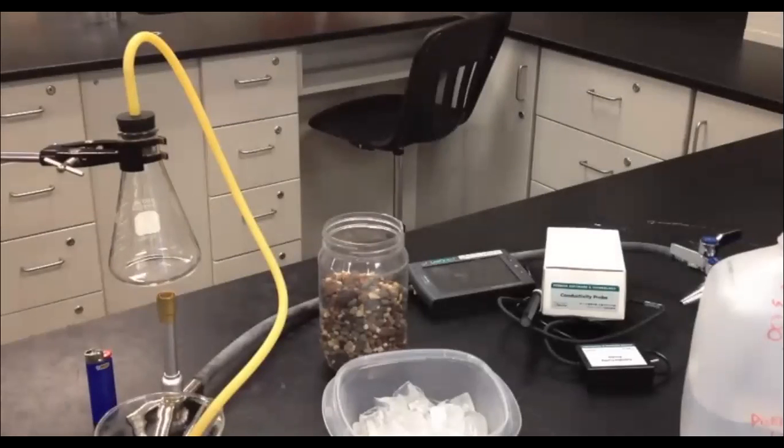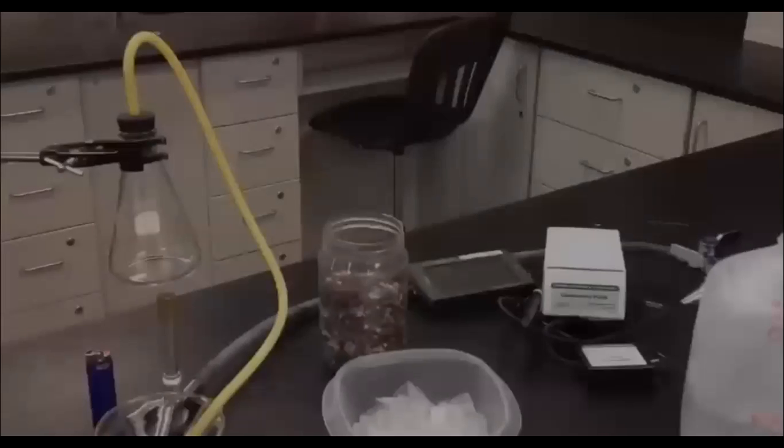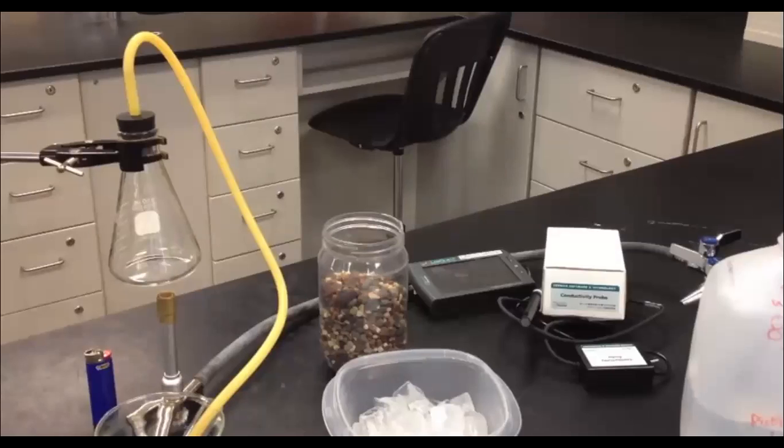So can we take salt water and turn it into fresh water? That's the purpose or objective of this lab, to take salt water and run it through a process called distillation and distill it into fresh water. The process of distillation is very energy intense.